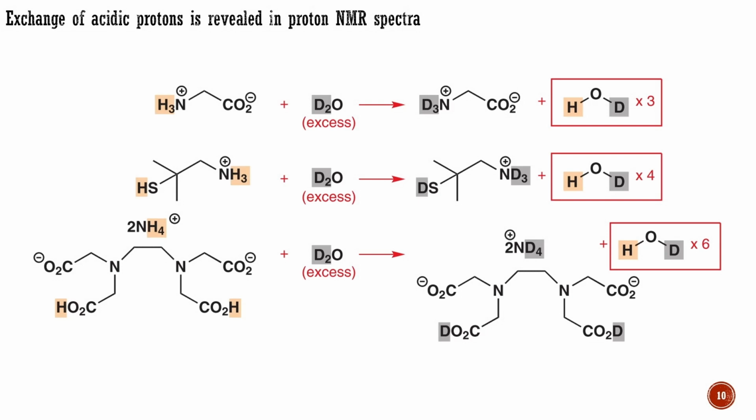The exchange between acidic protons is extremely fast, and the solvent, deuterated water in this case, supplies a vast excess of exchangeable deuteriums. These immediately replace all the OH, NH, and SH protons in the molecules with deuteriums, forming monodeuterated water in the process. Recall that we do not see signals for deuterium atoms, that is why deuterated solvents are used. The same sort of exchange between OH or NH protons with each other or with traces of water in the sample means that the OH and NH peaks in most spectra are broader than the peaks for CH protons.